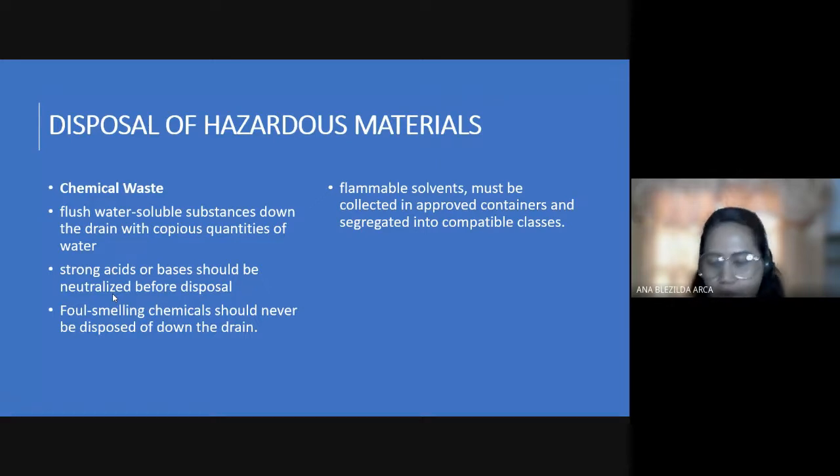How are you going to dispose them? Okay lang ba na basta ka na lang magtapon ng mga chemical? Yan ba ay tinatapon kasabay ng mga basura nyo sa bahay? Hindi, di ba? Okay? So, for the chemical, there are some chemicals that you can actually safely pour down the drain. Pwede naman na ibuhos mo lang siya sa lababo. However, you should actually neutralize it first. So kapag daw acid yan, kailangan lagyan mo muna siya ng base para ma-neutralize yung pH niya, and then flush with water dapat. Okay? That is if it is water soluble.